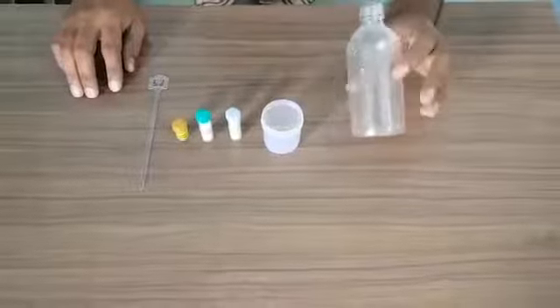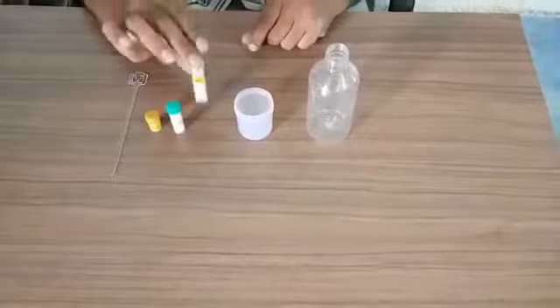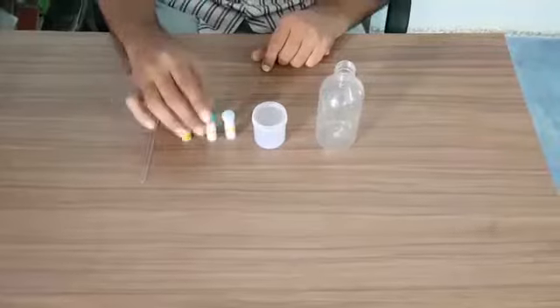Chameleon reaction. For this we need one empty bottle, a container, eating sugar, sodium hydroxide flakes, and potassium permanganate.